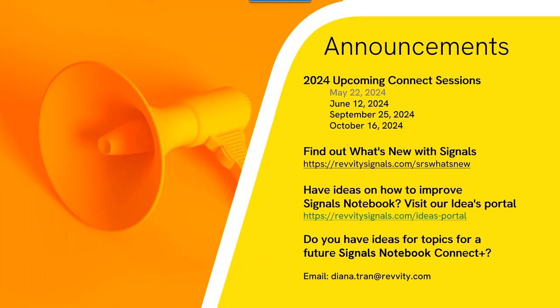Perfect. We have many other instruments, not just FACS. Can they be integrated so data flows smoothly within Signals Notebook?